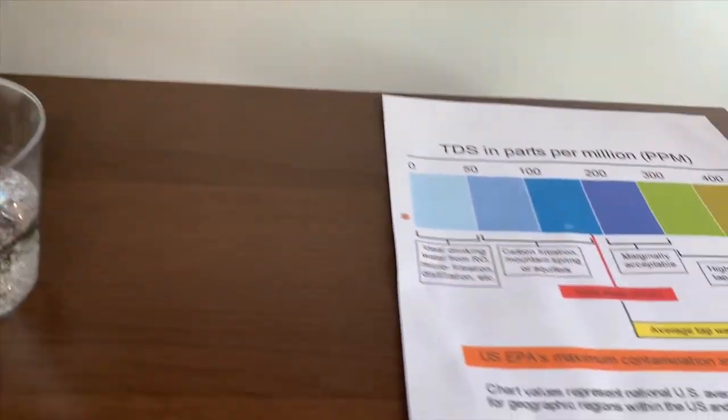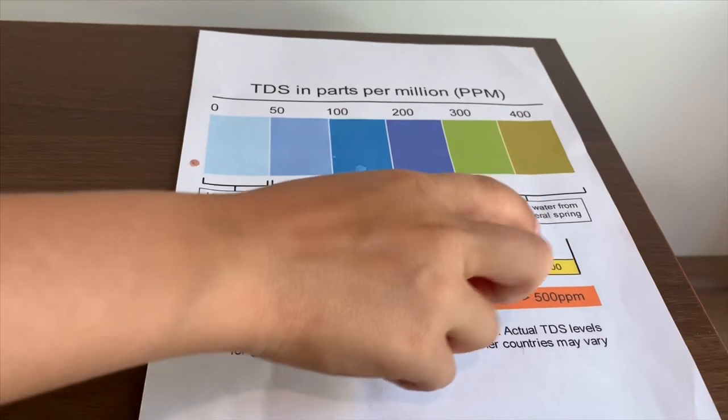It's in the 700s. That is high mineral content.